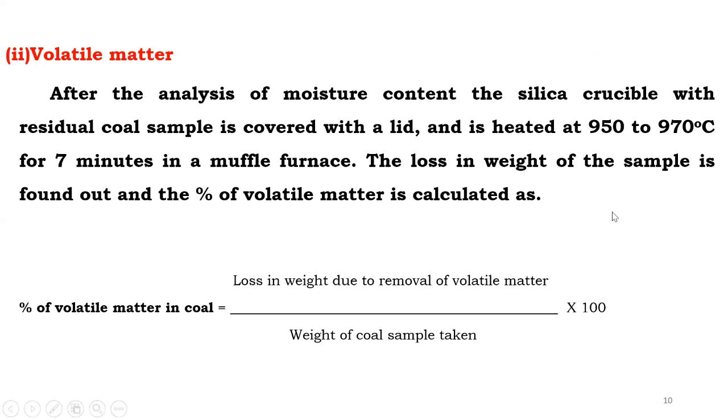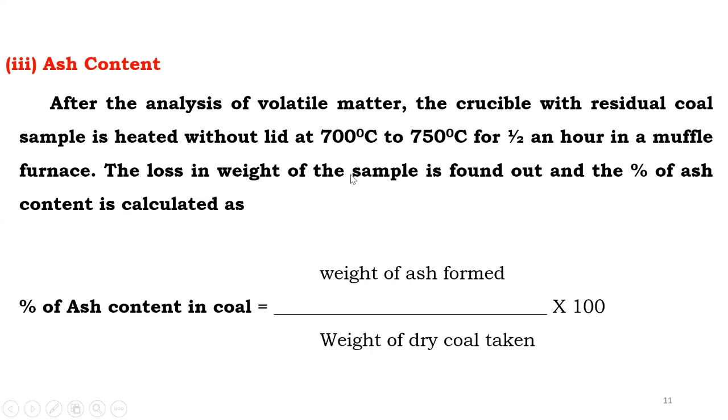Okay, so now we'll see what is ash content. We have already discussed it: the ash content is the remaining portion of the non-combustible material.